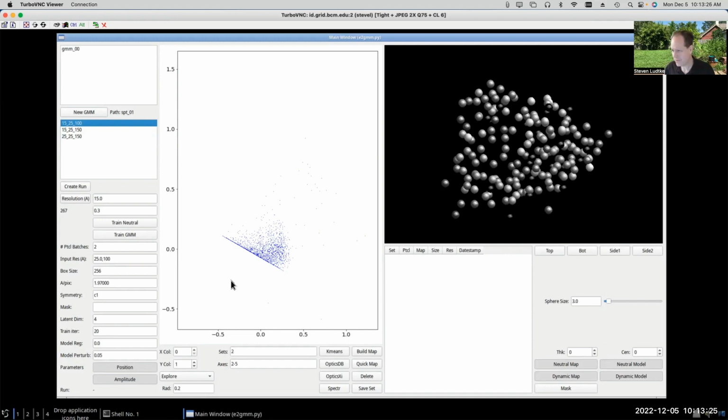Now, I had mixed feelings about using this tomographic data as the basis for the tutorial. The downside about this tomographic data is there are actually very few data points. Each 3D particle is used as a data point here, rather than a 2D particle like it might be.